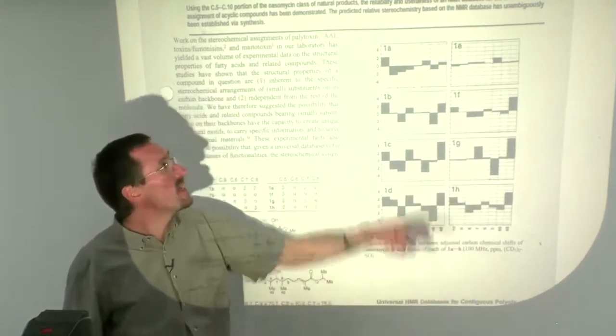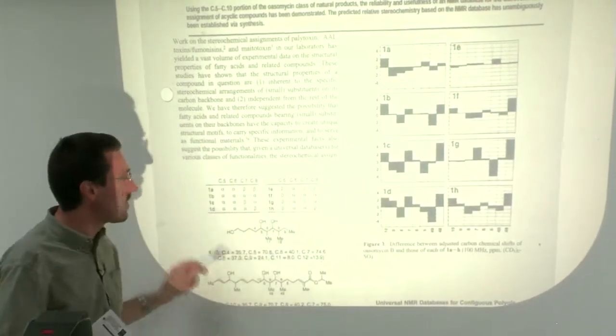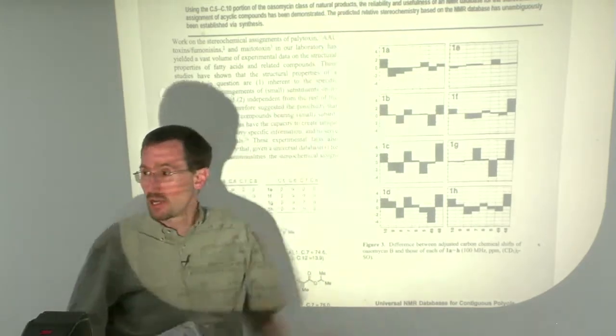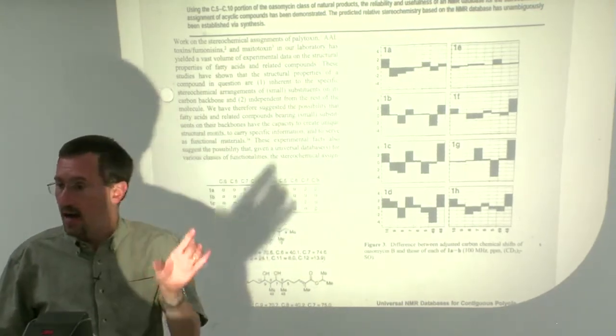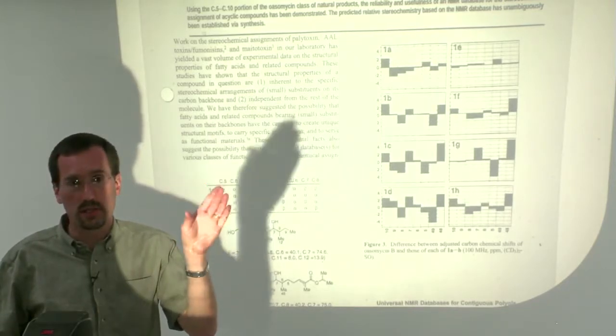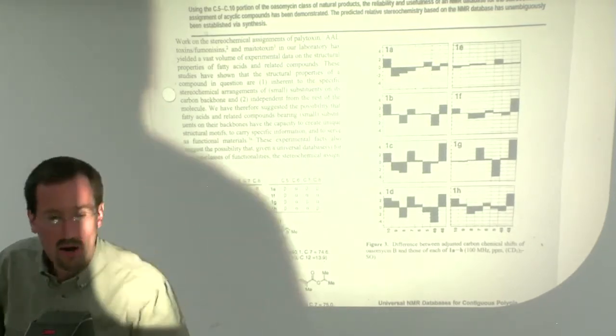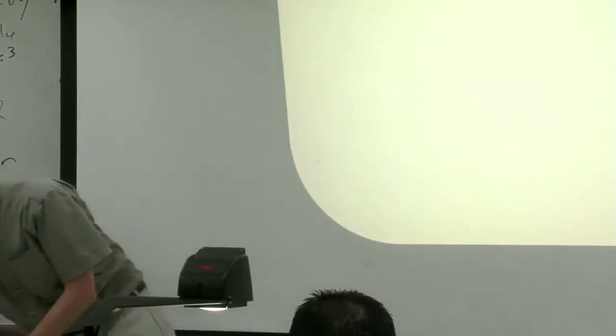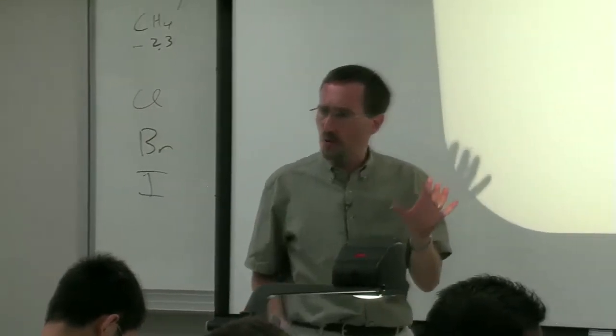So that means you can then take an unknown compound based on this training set and the database and say, the pattern matches this stereochemistry. All right, last example I want to talk about, and this was really cool. So this is all calculating based on known information.